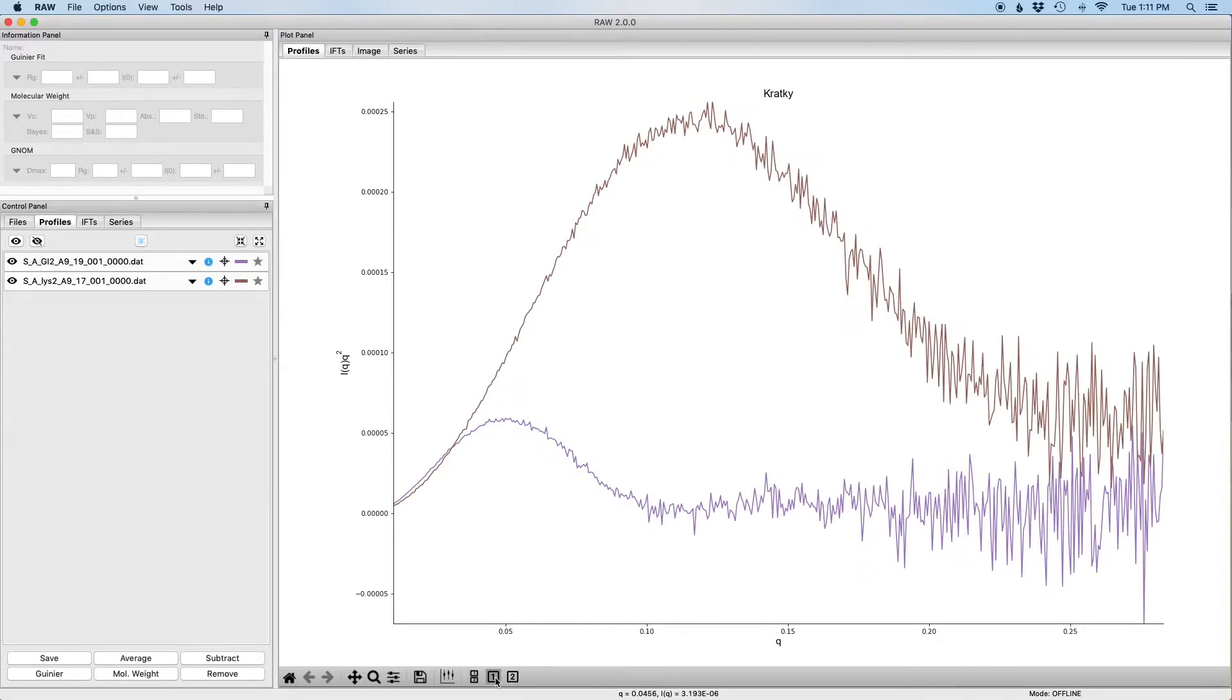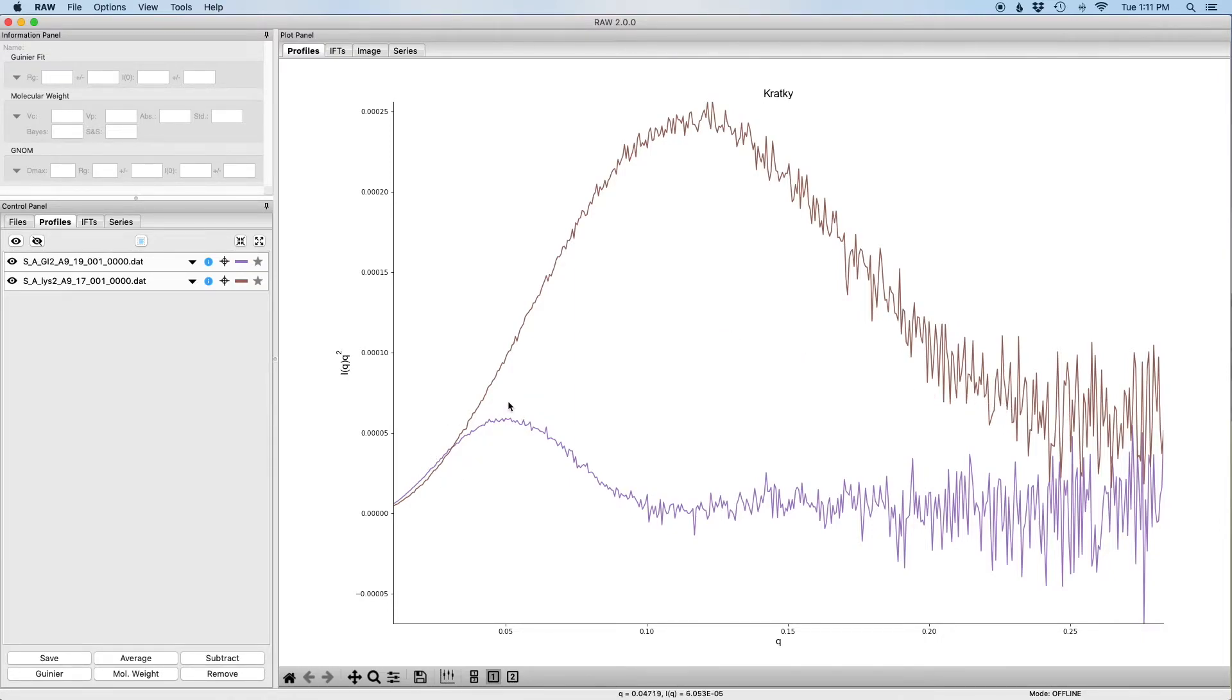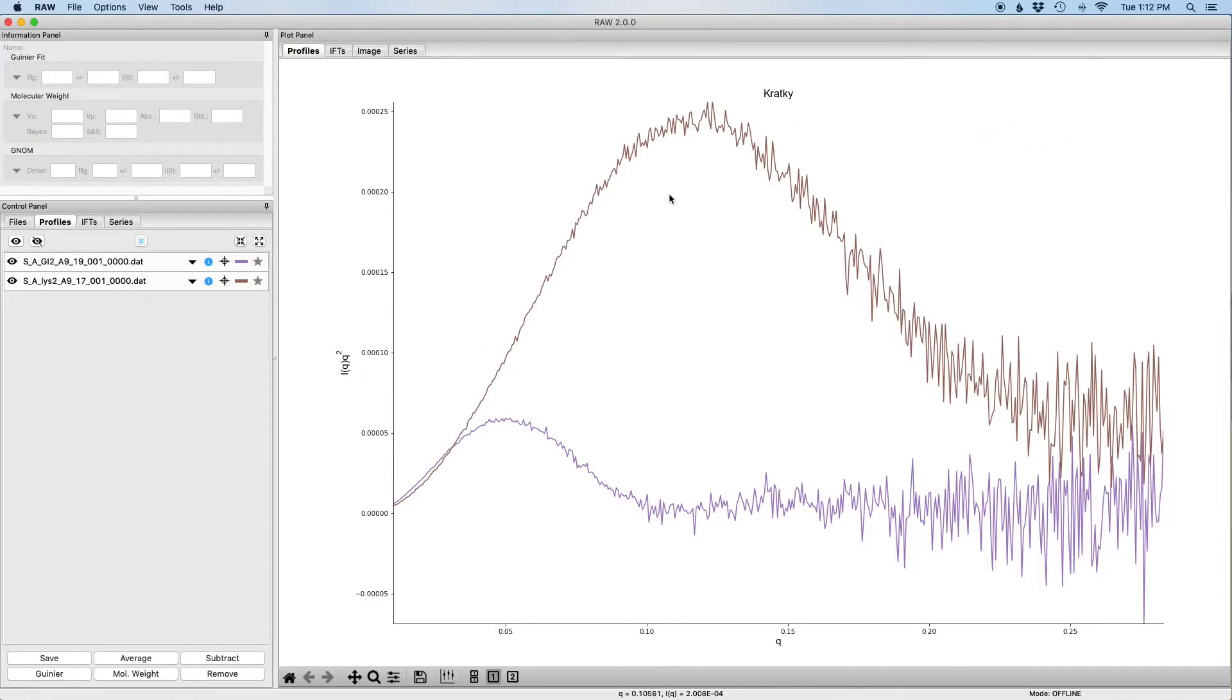So when scattering profiles are plotted on a Kratky axis, a nice bell-like kind of Gaussian shape like this indicates a folded scattering profile. An unfolded scattering profile is going to come up and then plateau, whereas something that has both folded and unfolded regions will have some amount of bell and then some plateau later on.